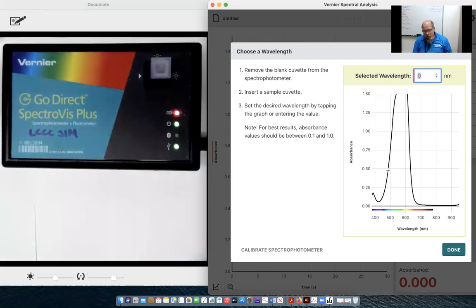But with dyes, biological stains, they have a tendency to have a very deep, rich color. So I'm putting this inside here, and you'll notice that my curve is actually sort of spiking here above an absorbance of 1.5. Normally, we would want to have a concentration so we don't go above 1 because this absorbance relationship relative to concentration is tied into a natural log relationship. So it's actually a logarithmic scale that we're looking at here. And we start losing direct linearity between the absorbance and the concentration if your absorbance values exceed 1. But in this case, we're going to be causing the color to fade and disappear, so it's okay to start at a higher value.